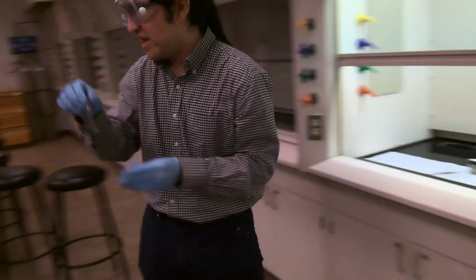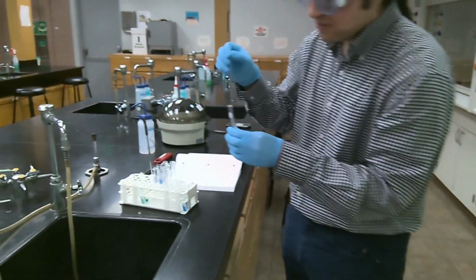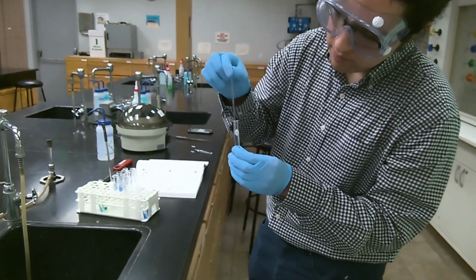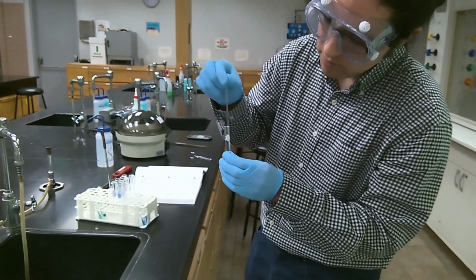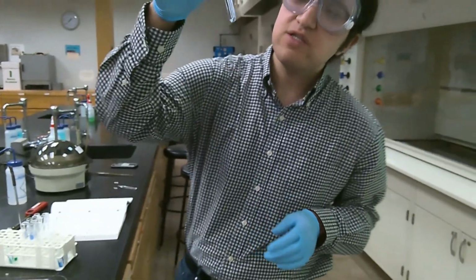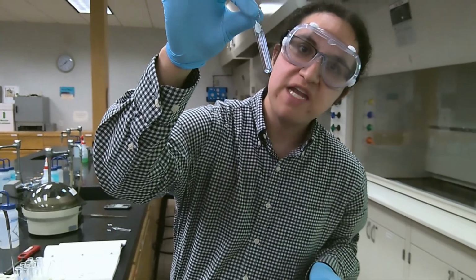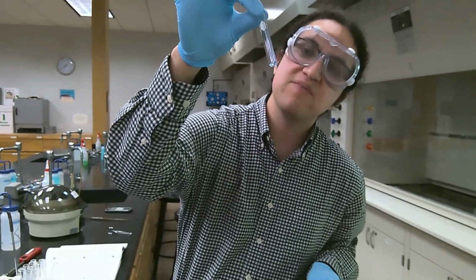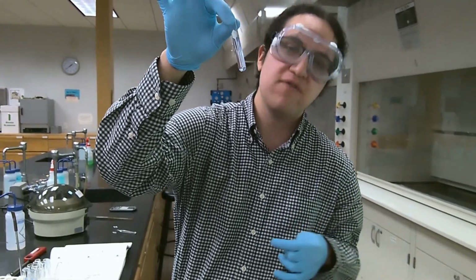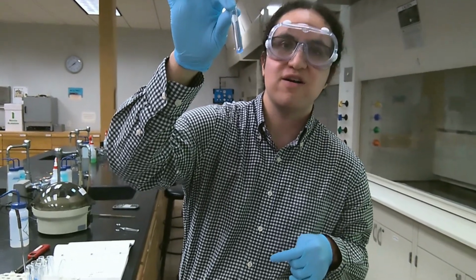Okay, next we're going to agitate. And as we have noticed, we do not observe any additional precipitate. So that implies that we've completely precipitated out almost all of our insoluble copper hydroxide.